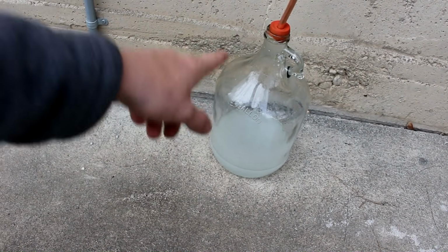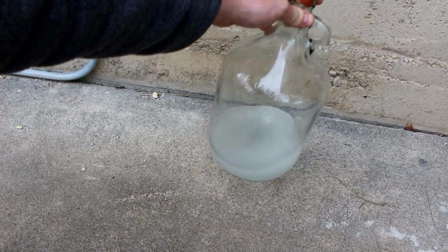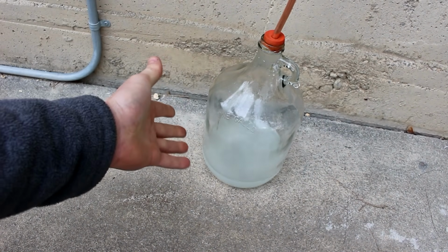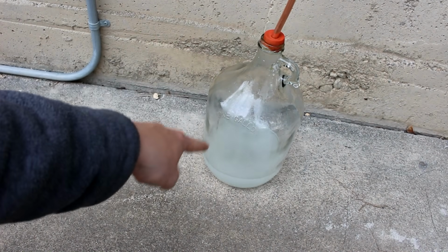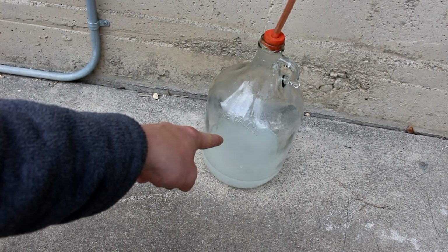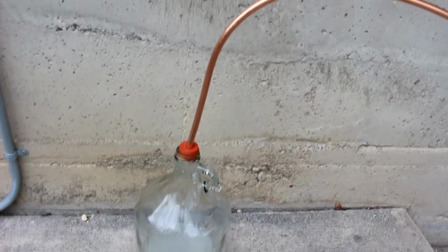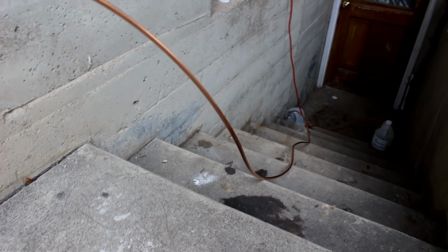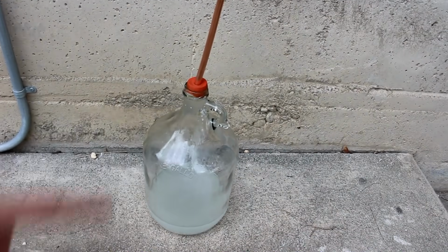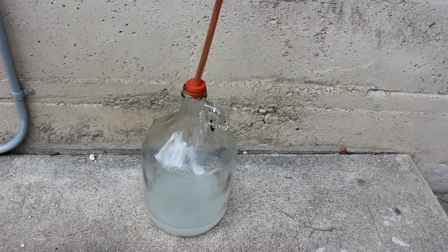Okay, so it's the next morning and I've reset with another jug, and I'm using smaller batches this time. That way it doesn't have quite so much going off all at once. So there's 500 milliliters and half a pound of sodium hydroxide in here right now. Also, you'll notice I've got this copper tube coming off of it, and that'll collect all the vapors, and hopefully by the time it gets way down there it'll be condensed into a liquid. I'll capture it into that jug, and then at which point I can put it back into the system. Anyway, let's get to putting those aluminum pieces back in and see how this turns out.